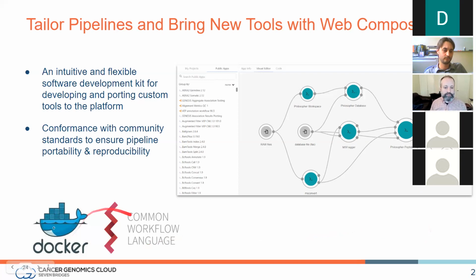It's built on two things. Now, we asked you if you're familiar with Docker. About half of you said yes, and the other half said no. You don't have to be, and we're not going to cover making Docker containers today, but I just want to briefly mention what they are. They are portable compute environments. I was about to say Linux environments, but I guess you can have a Windows Docker, I suppose. But today we're going to be using all portable Linux containers.